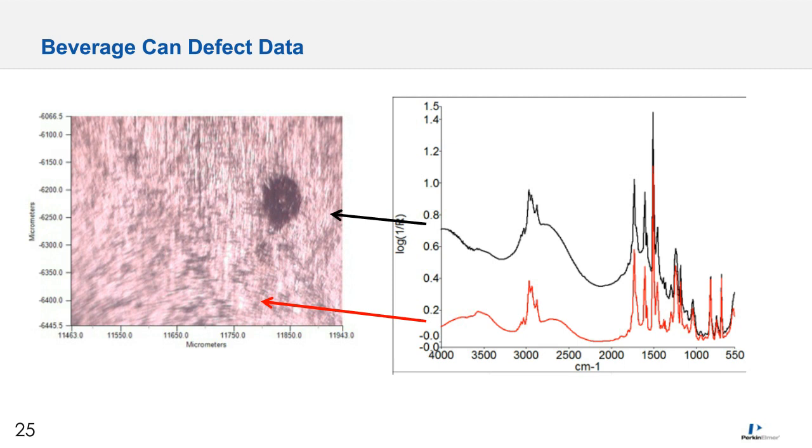Let's look more closely at the spectral data shown at the right without any processing. These are the spectra as measured with the system. Note the slope in the baseline of the spectrum measured at the defect. This indicates scattering of light, typically by an irregular or rough surface. Secondly, note the broad sinusoidal baseline artifact. This is typically called a fringe pattern and is the result of the measurement of 2 interfering rays of light, as described on the previous slide.